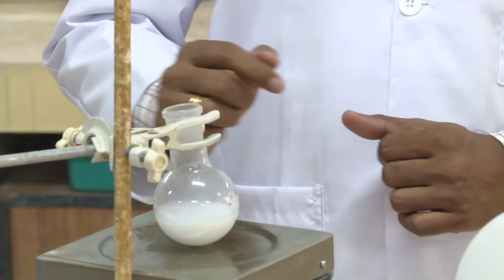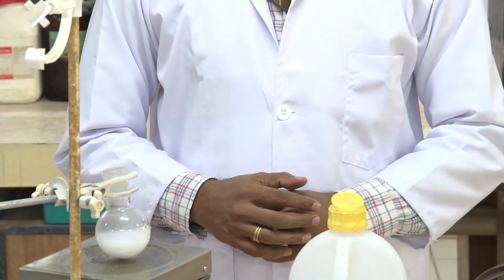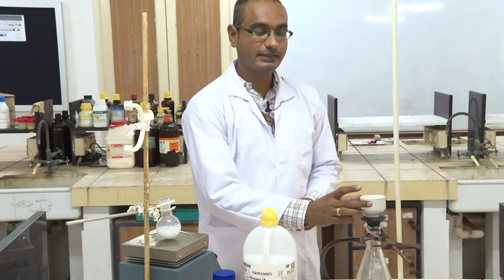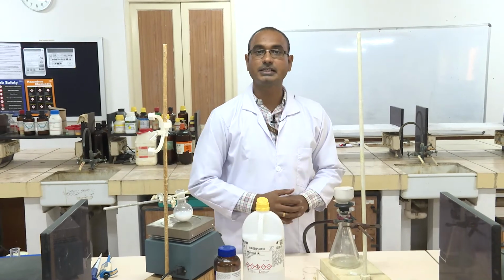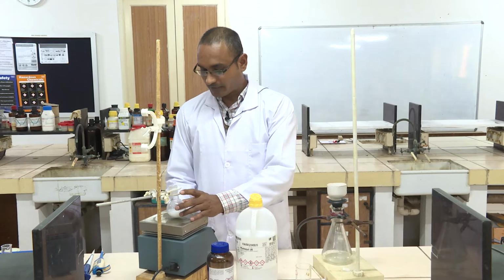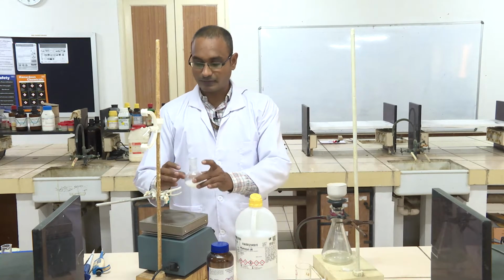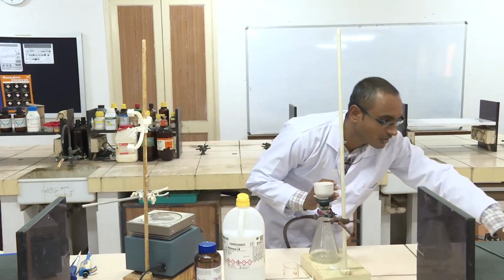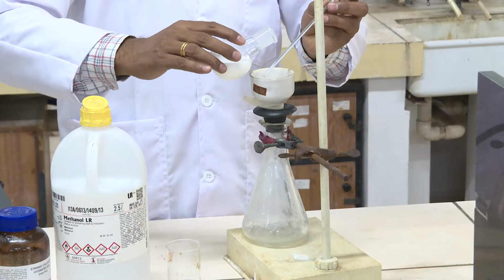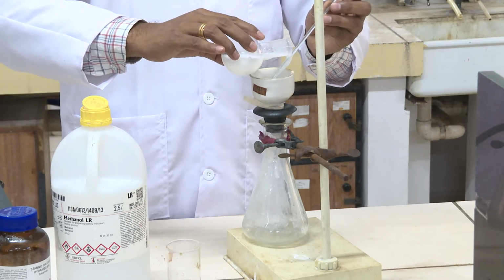Okay, now this is the colloidal solution. You can also call it a sol. Now I am going to do filtration using this Buchner funnel, which is fitted with Whatman filter paper. So now I am going to stop the reaction. Now I am going to transfer this colloidal solution. I am going to switch on the vacuum. For doing the filtration, now I am going to filter it through the Buchner funnel.